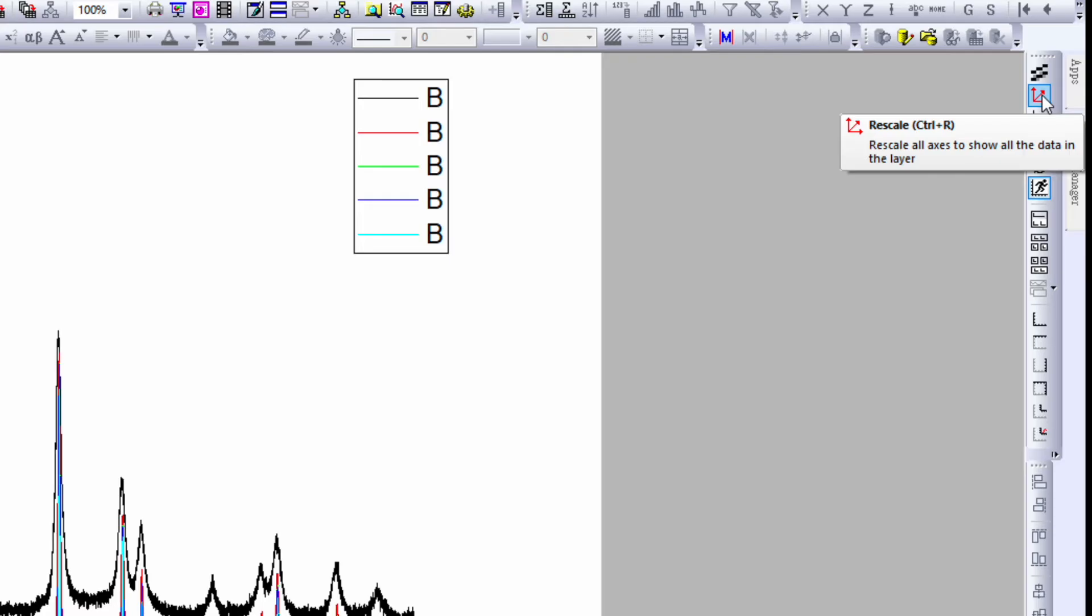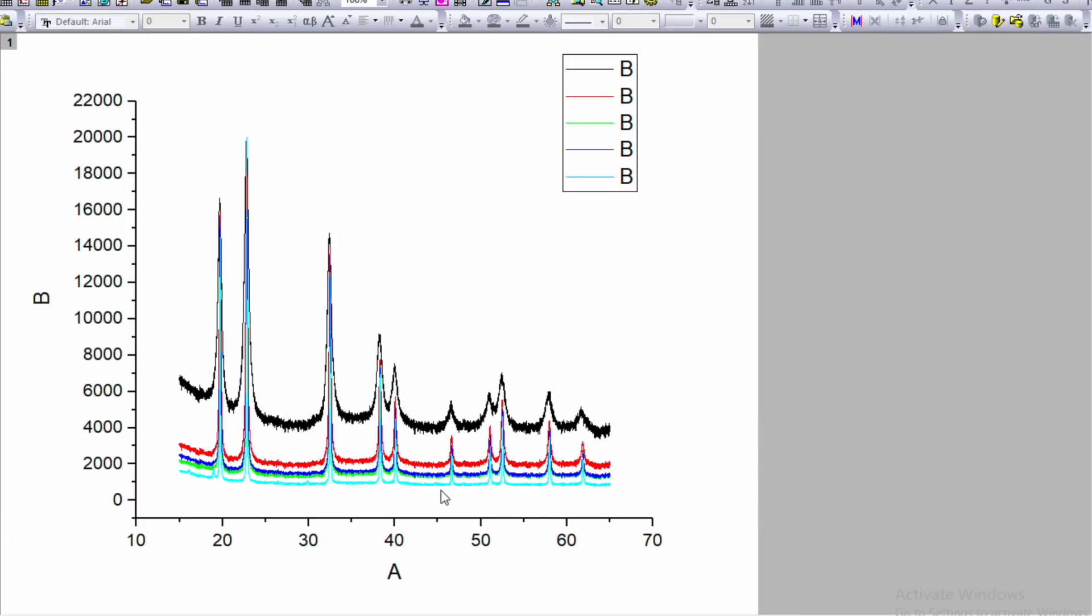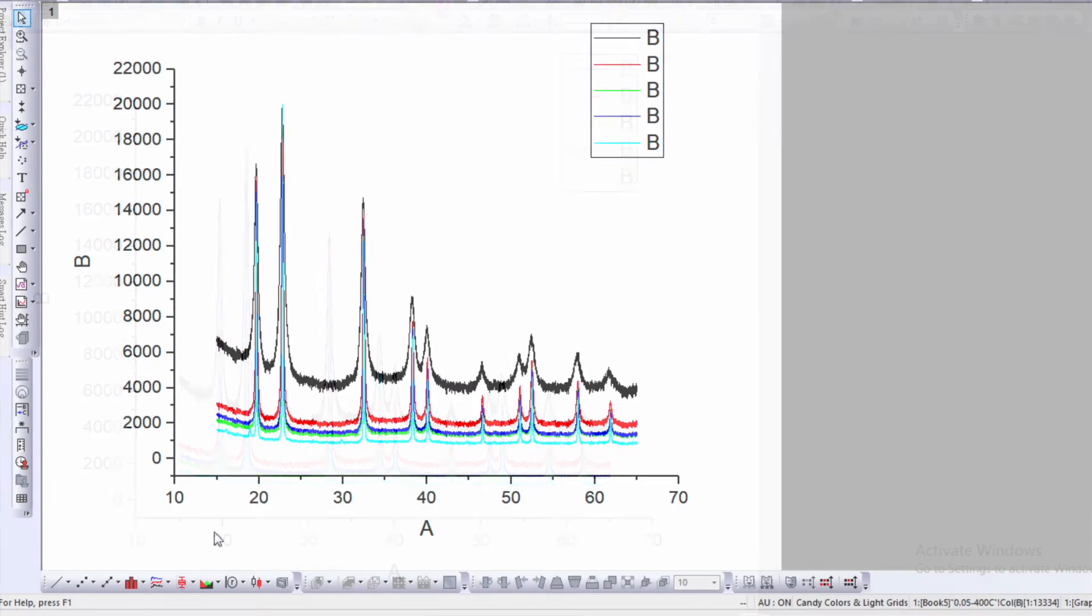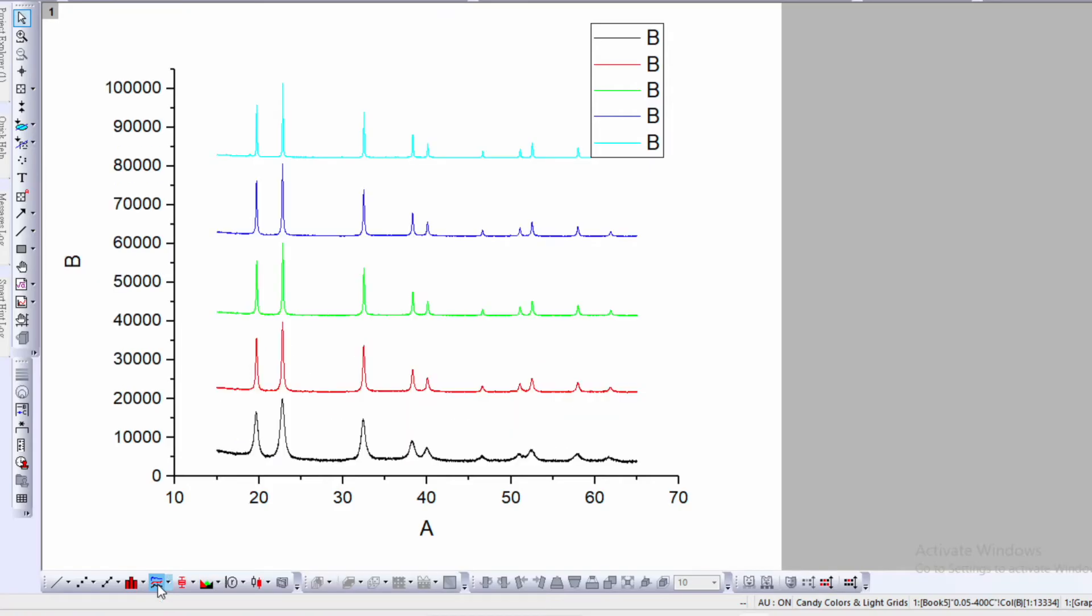Go to the right upper corner for the scale option, or use shortcut Control+R. We can see all of them, but they're overlapping. We need them vertically stacked. Go to the left bottom corner and see the option 'stacked line by y offset'. Click here to automatically stack the data in vertically offset format.